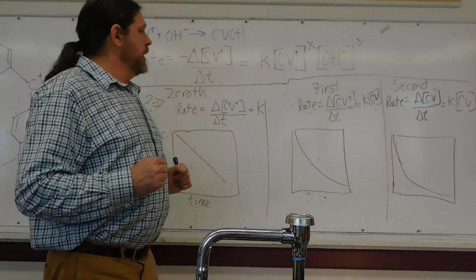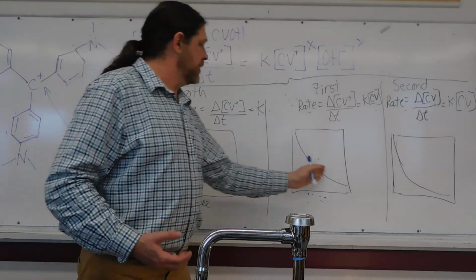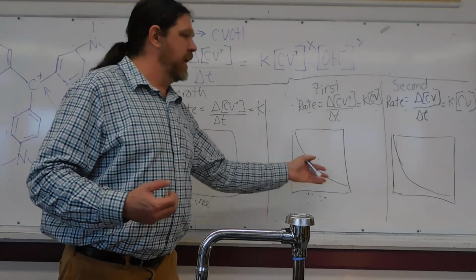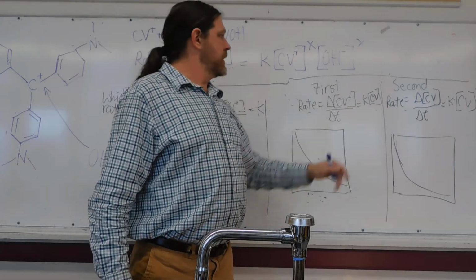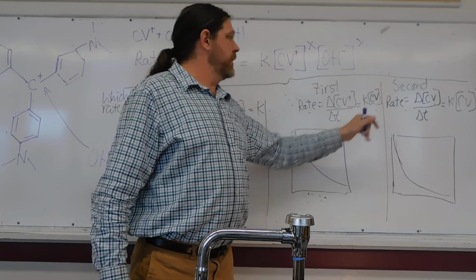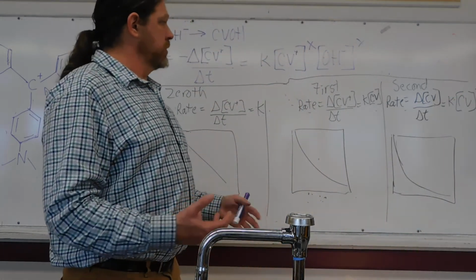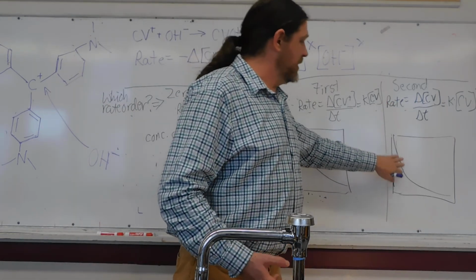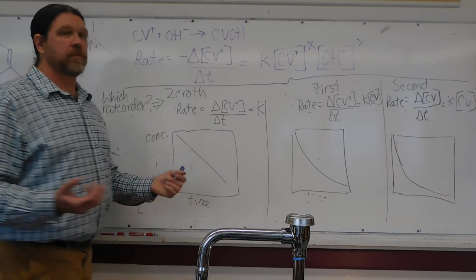On the other hand, if a doubling of our concentration causes a doubling of the reaction rate, we can model this way, and we should see more or less this type of change in the data once it has been graphed, and thus rate equals our constant times our concentration of CV. However, if a doubling of CV causes a fourfold increase in our rate, or thus a fourfold increase in disappearance, so to speak, which is a sharper curve here, this is a second order reaction.